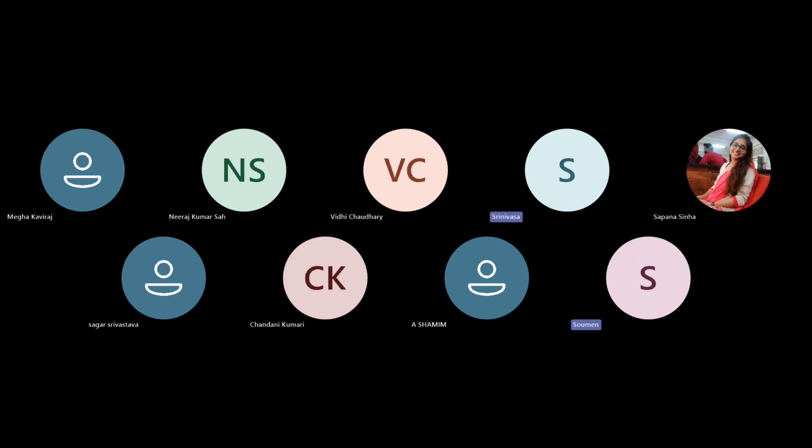See, the problem with polymer NOESY is that you have a fast rotation, correct? You have a simple linear chain. When the polymer has a simple linear chain, the bond rotation is fast. When the bond rotation is fast, the NOESY is not effectively seen for the neighboring protons. But anyway, if there are restricted motions or if it is a fixed geometry, then NOESY can be seen.